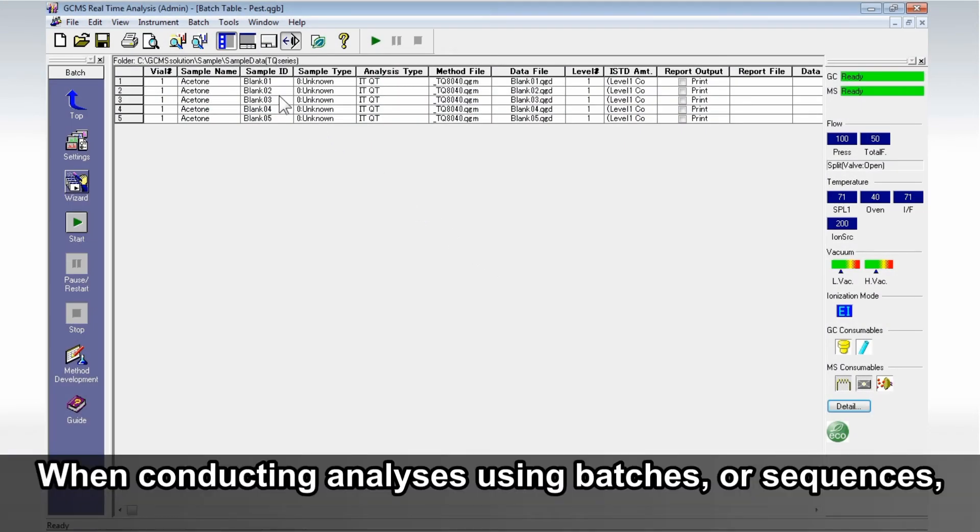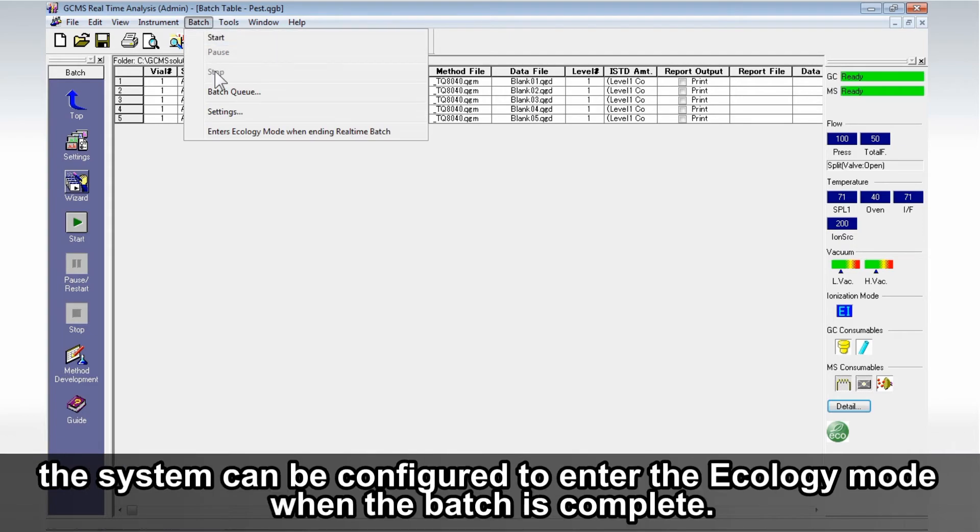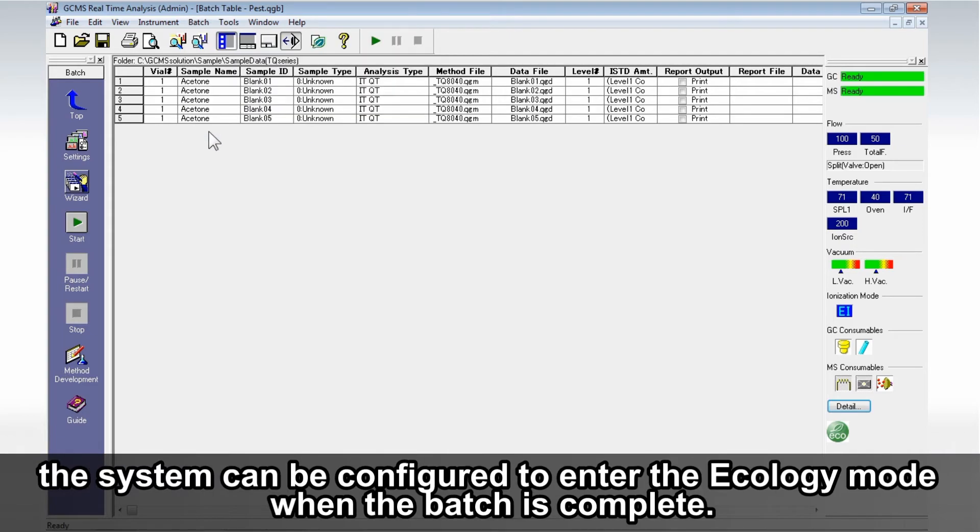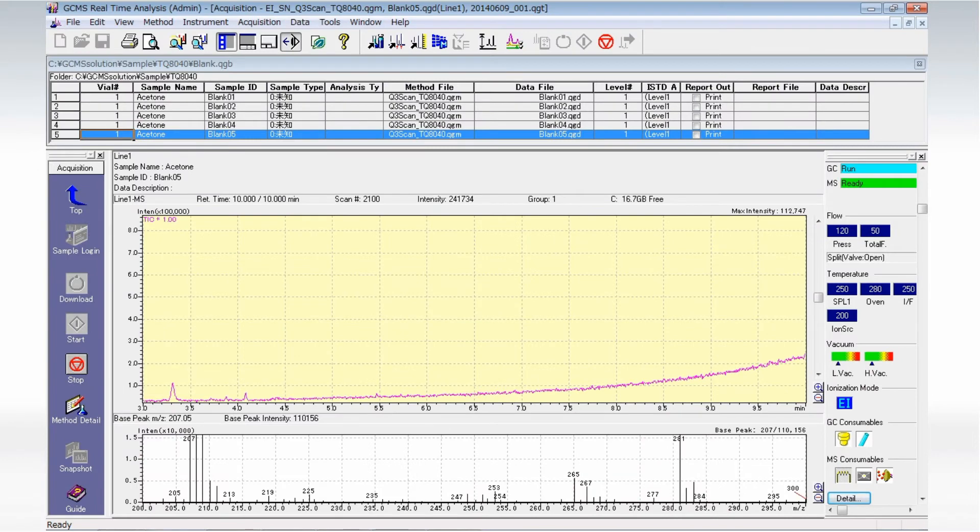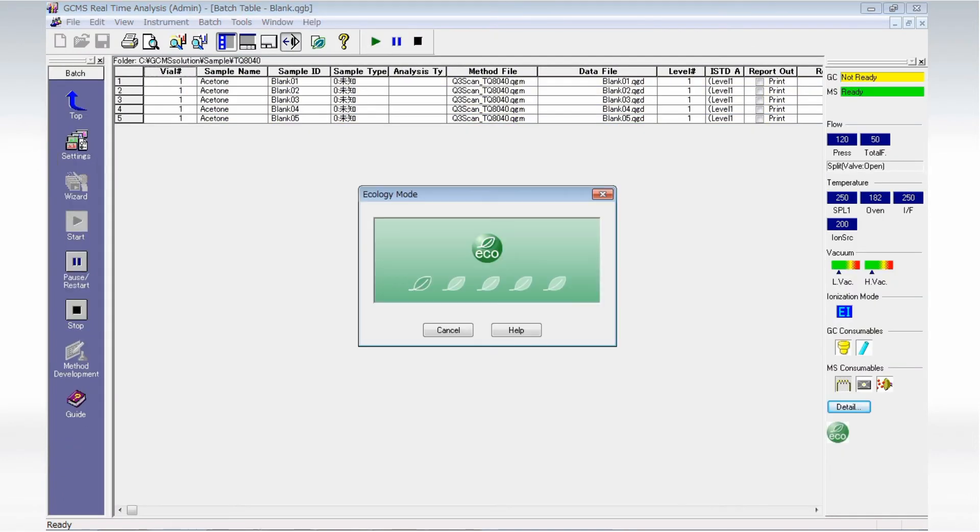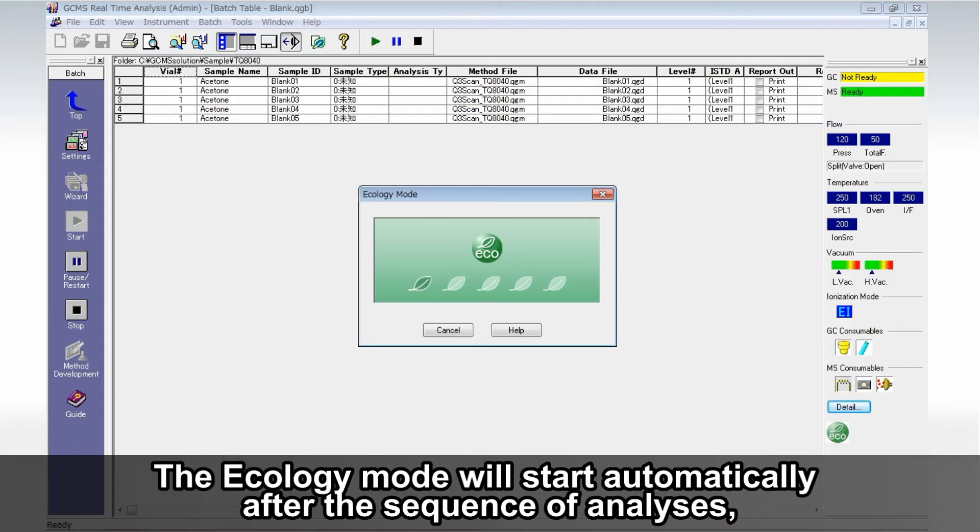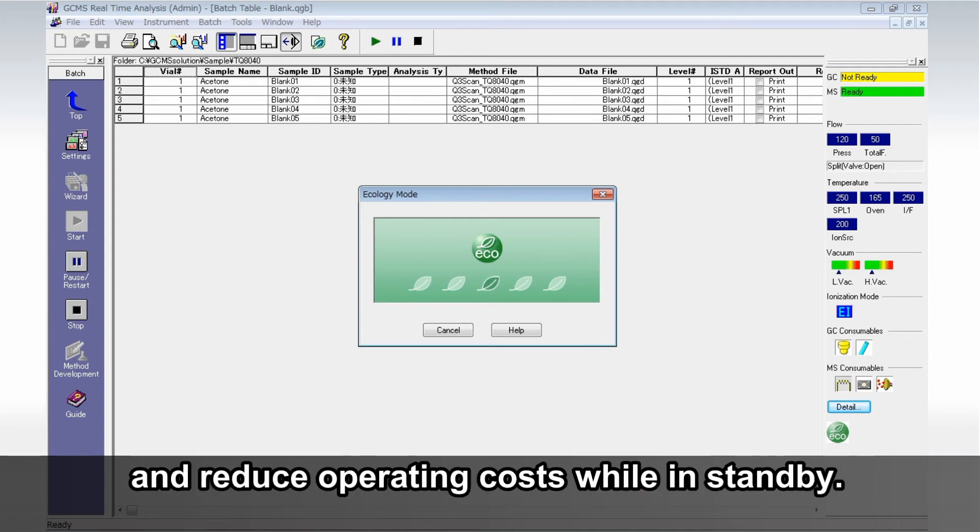When conducting analyses using batches or sequences, the system can be configured to enter the Ecology Mode when the batch is complete. The Ecology Mode will start automatically after the sequence of analyses and reduce operating costs while in standby.